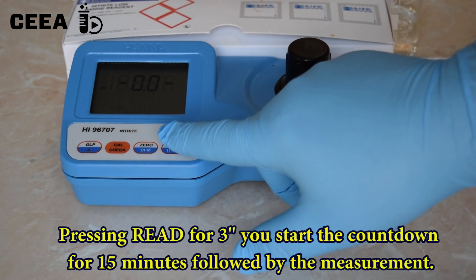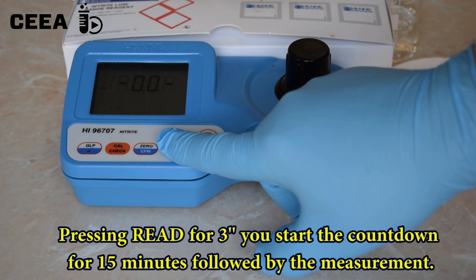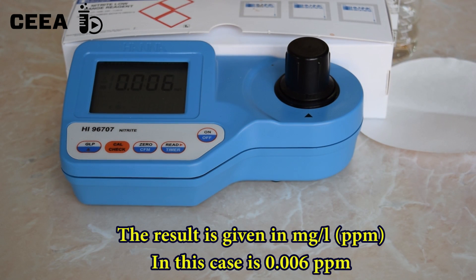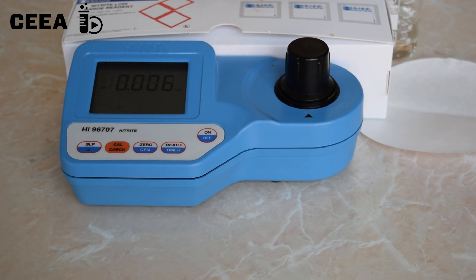Then the cuvette is placed in the photometer and the 15-minute countdown is started. The photometer measures the nitrite content in ppm, being very sensitive to nitrite traces in water.